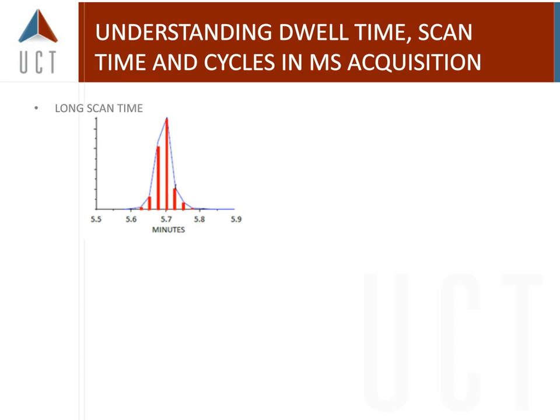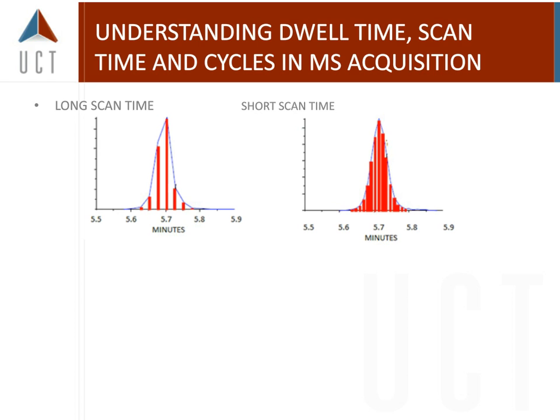So if you have a wide chromatographic peak, because it's not chromatographing properly on the column you've chosen, you may try to tighten that up by changing your scan time. Here's something that has a long scan time, and if you see here, there's 6 points taken. And if you notice where all of the points of the scan are, if you follow the numbers, it looks more jagged. You don't have enough points, so you might have a scan time that's too long. By shortening that scan time, you may be able to get more points on that particular curve.